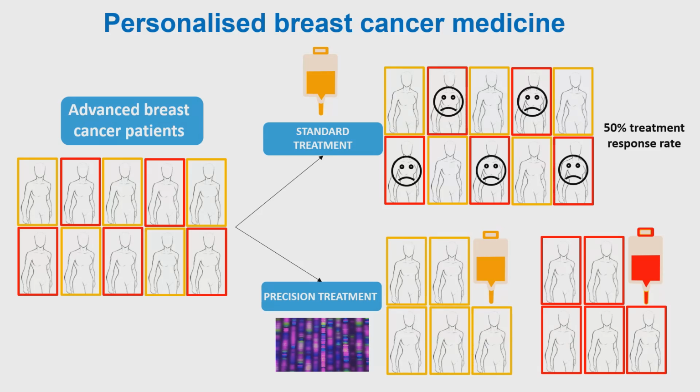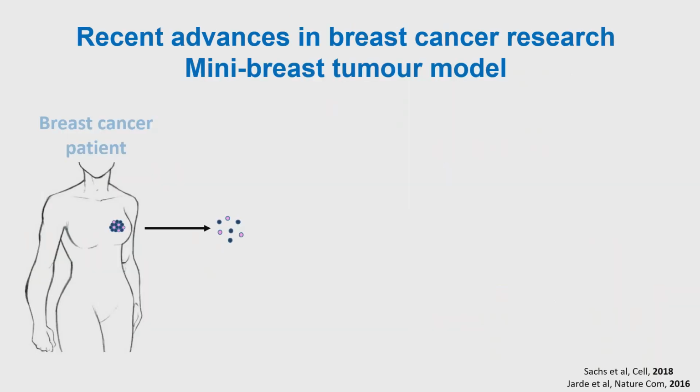Well, because this is an organoid symposium presentation, of course, we believe that developing breast cancer organoids for breast cancer patients and performing drug testing can really help us identify drugs that are efficient. So if we focus on breast cancer organoids, we contributed to at least the identification of the growth factors that were required to sustain breast cells in culture. This model, the breast cancer organoid model, was described in 2018 by Sachs et al.